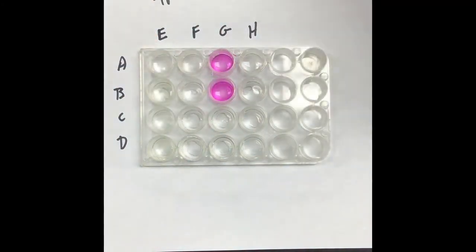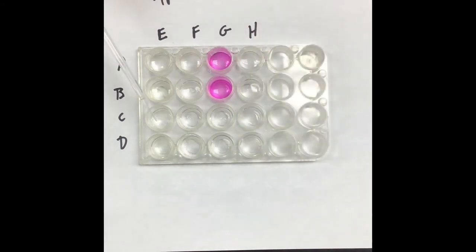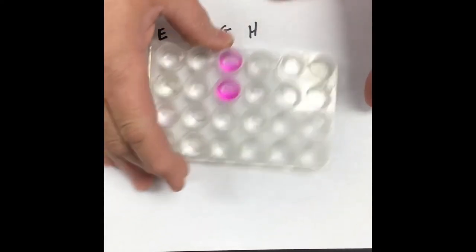We're going to move on with C. So here is C. Where'd it go? 10 drops. Okay, so that was 10 drops all the way across C. Shake that up a little bit.